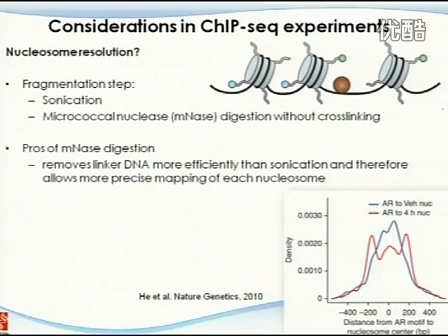For example, in a study in Nature Genetics, they found that estrogen receptor and androgen receptor make the histone markers move slightly when you treat with them. Those slight dynamics you cannot really observe with sonication; only this type of digestion will be helpful.